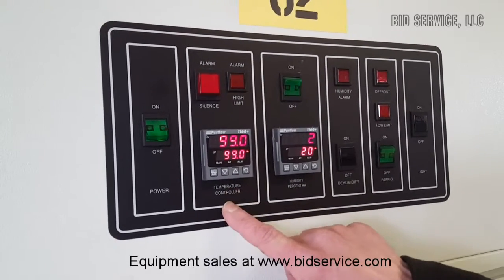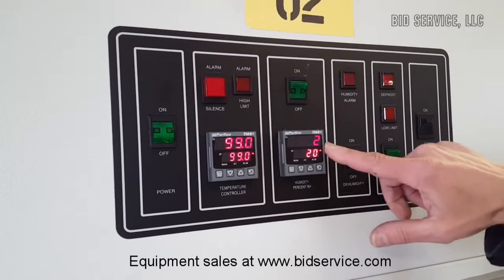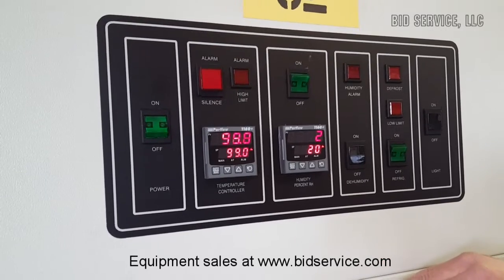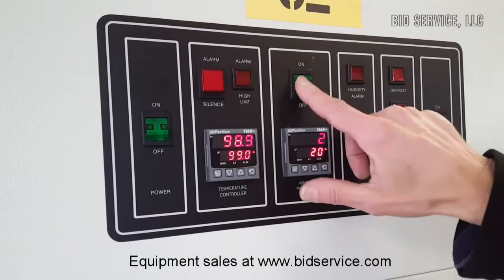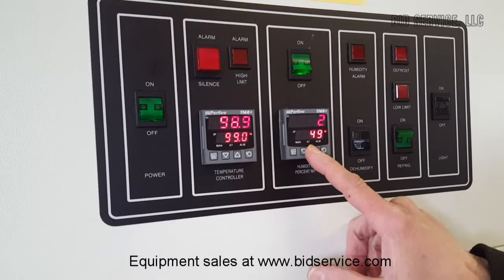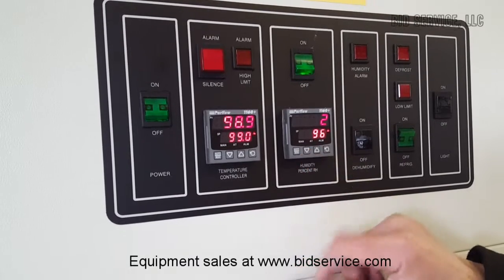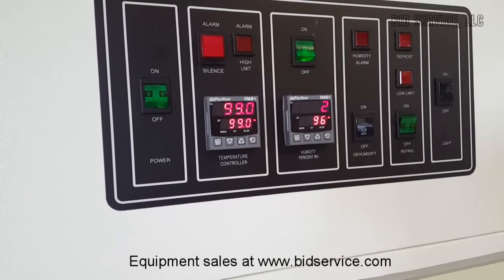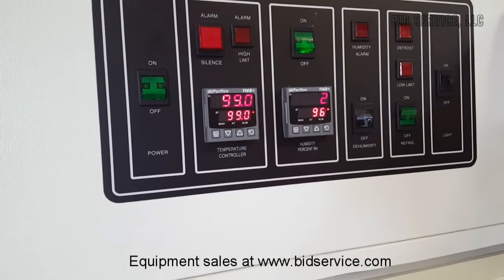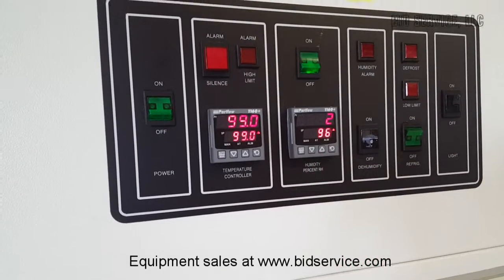Now we have the temperature inside the chamber up to 99 Celsius. You can see the humidity is very low here — it's at 2% relative humidity. So what we'll do now is turn the humidifier on and set it up to 96%. It'll take a little while for that boiler to start generating some humidity inside the chamber, and we'll come back later and take a look at it at 96%.